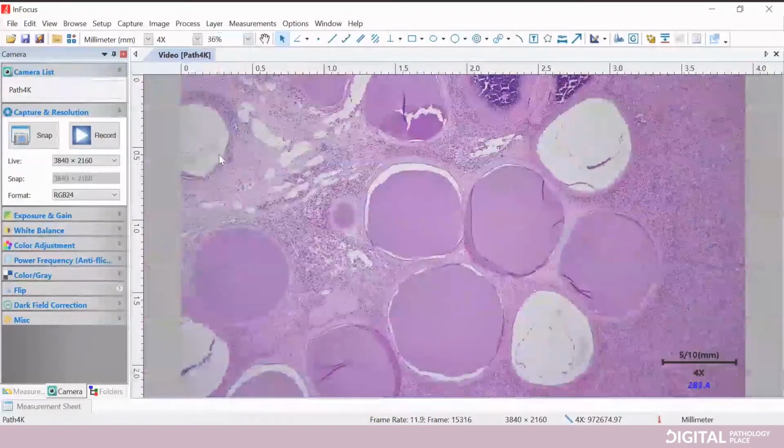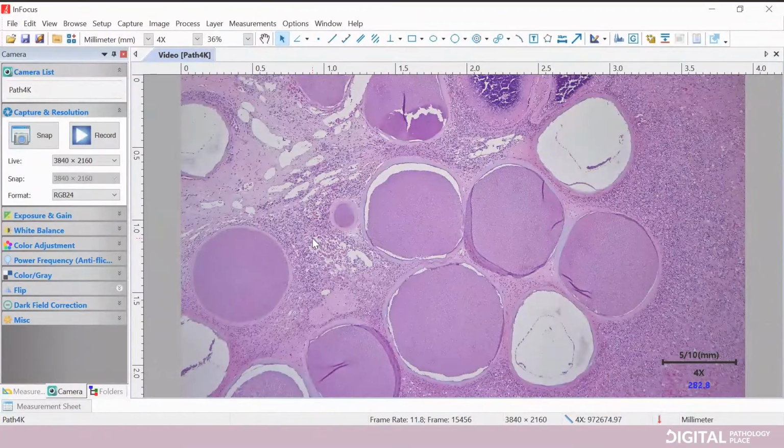So you see a full field, you can zoom in without the need to increase your objective, and just know that you do have some optical resolution built in without getting to the digital zoom. A bit over the top there, but I just wanted to explain why some people ask why this says it's zoomed out.